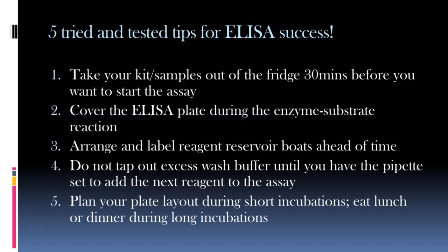Secondly, and I alluded to this earlier, covering the ELISA plate during the enzyme substrate reaction has produced significantly better signal amplification for me. And I think, again, that's because that substrate is so light sensitive.